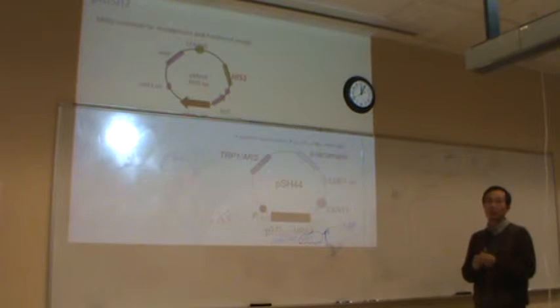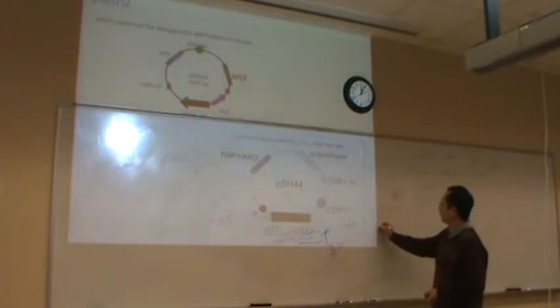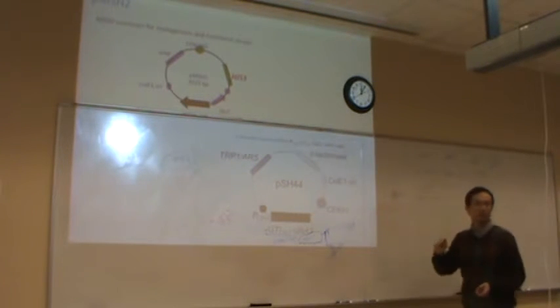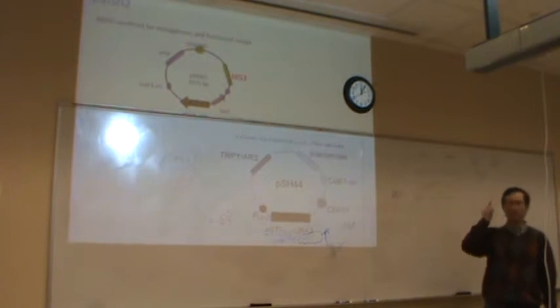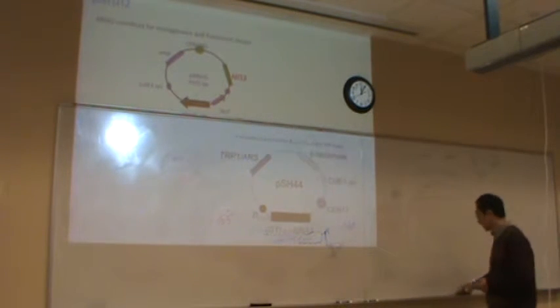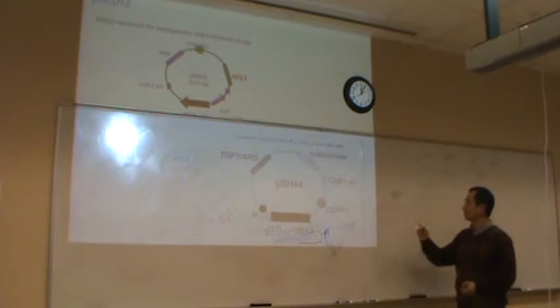So that's what works. So we have to put the vector, just the vector, the pRS413 vector. It's probably 413. Okay, you agree? Okay, thank you. Alright. That's our vector control.